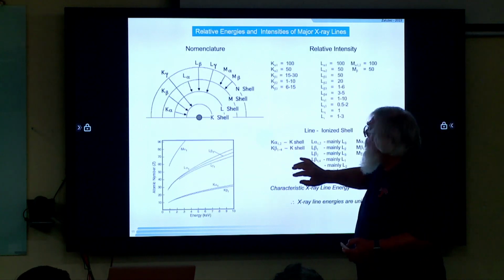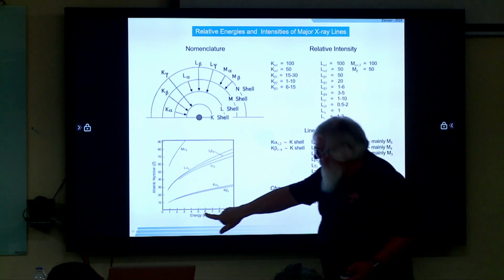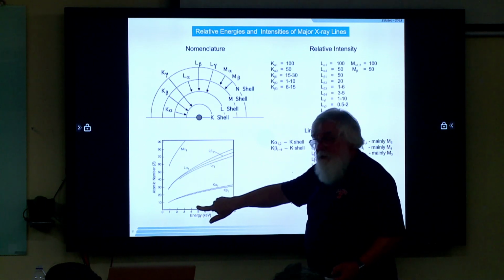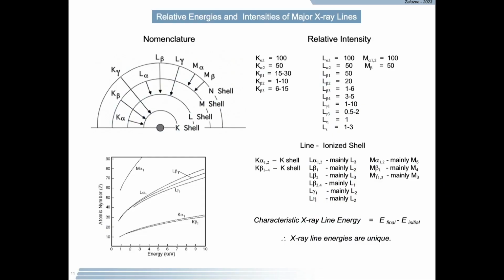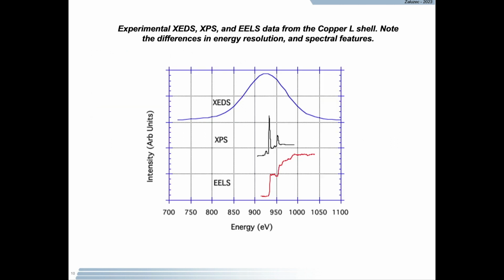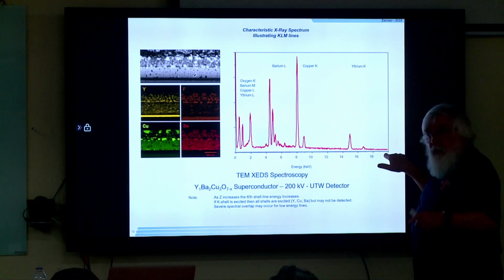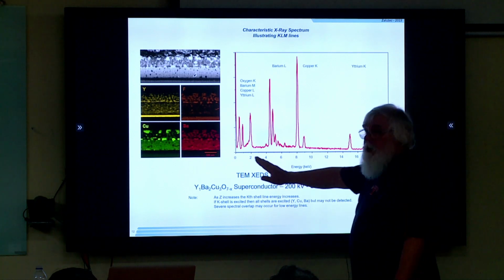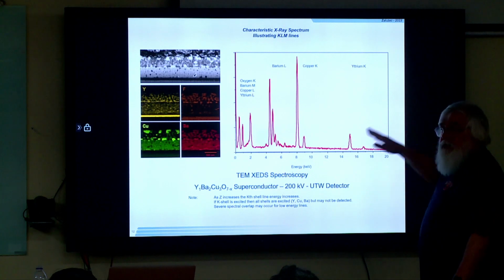In barium, we're going to be looking at the L shell intensities. Why? Because barium's up here, and I want something in this energy range. There is a barium K. It's up here somewhere at a much higher energy, and that we don't see in the spectrum. It only goes to 20 kV. You can measure spectra at much higher energies. Most people tend to work in the range from 0 to 20. Occasionally they'll go to 40. It's very rare for somebody to go higher.